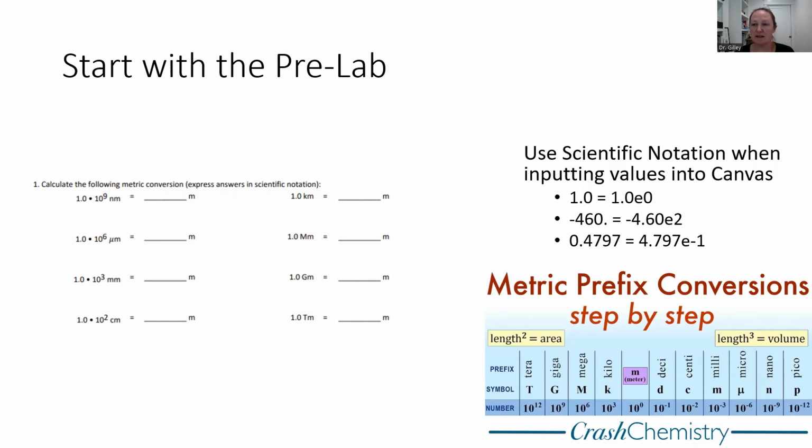And then there are often these prefixes involved where it might not be a measurement in meters, for example, but instead of that, centimeters or nanometers. And the same thing could be true with other units. You could talk about milligrams, that's a common one. So it doesn't matter what the metric unit is, for example, grams, liters, meters. We still want to be familiar with these prefixes that can be used interchangeably. And so this part is asking you to really think about some of these prefixes.